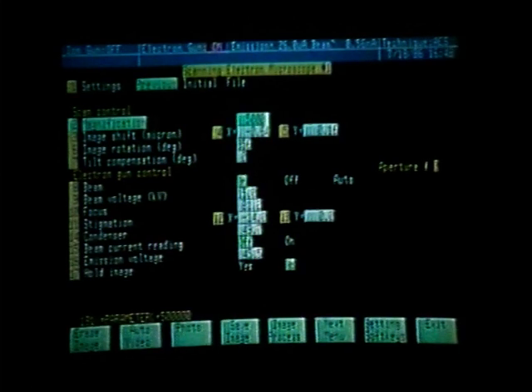We have now gone through an auto video. We have re-registered the sample according to our mark on the TV monitor. We can again, using the fine focus, refocus the image. We are now ready to go to the desired magnification for the next SEM photo, which was a magnification of 500x.